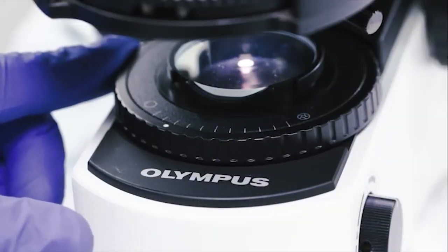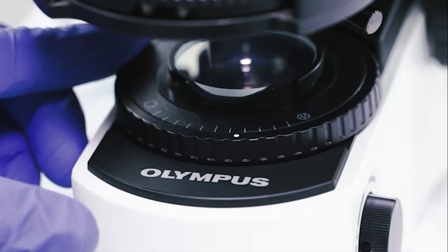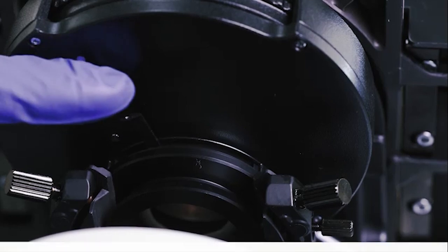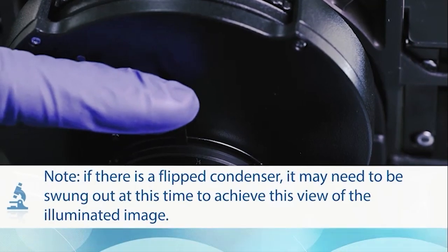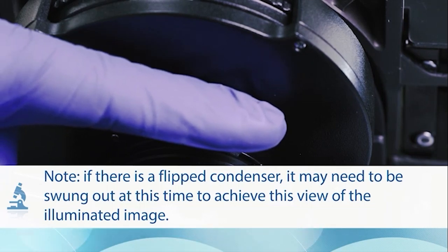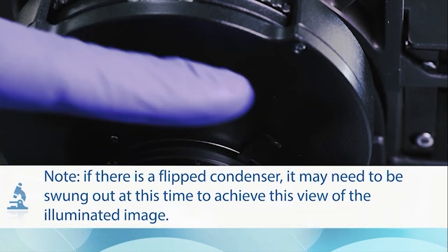Close the field diaphragm until the diameter of the illuminated image is smaller than the field of view. Please note, if there is a flipped condenser, it may need to be swung out at this time to achieve this view of the illuminated image.